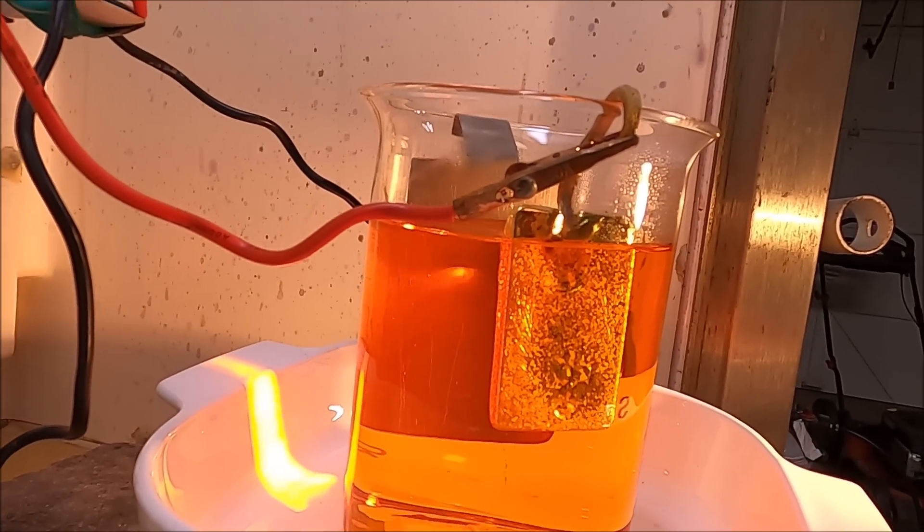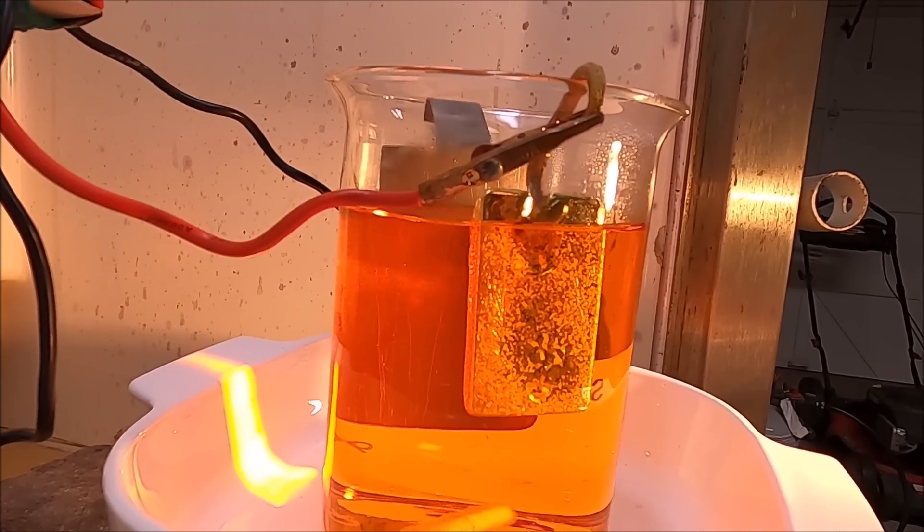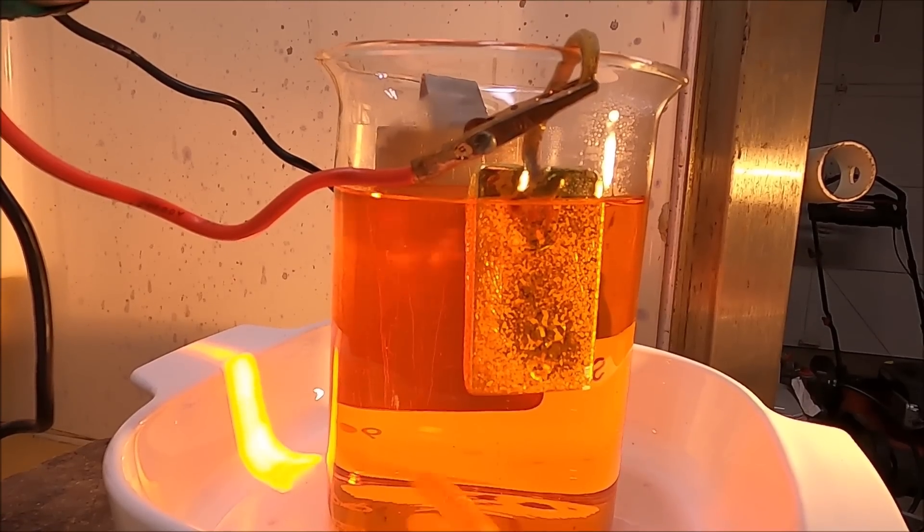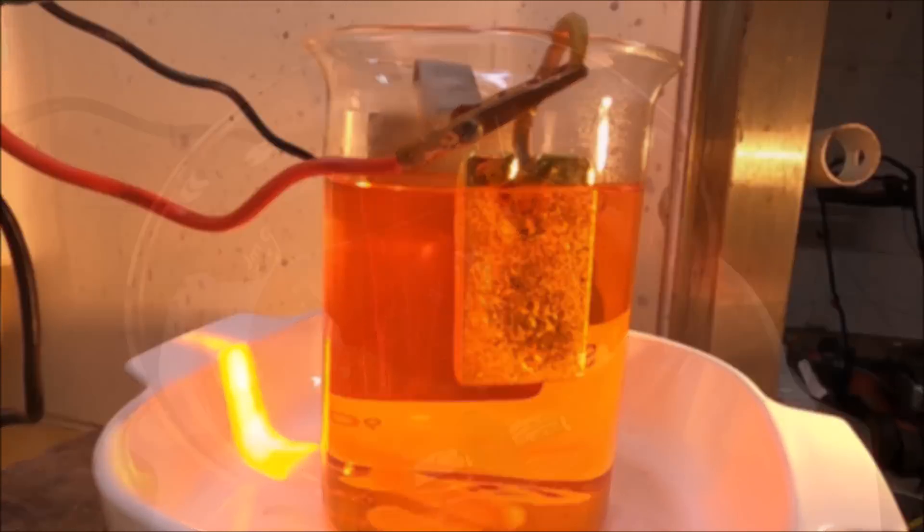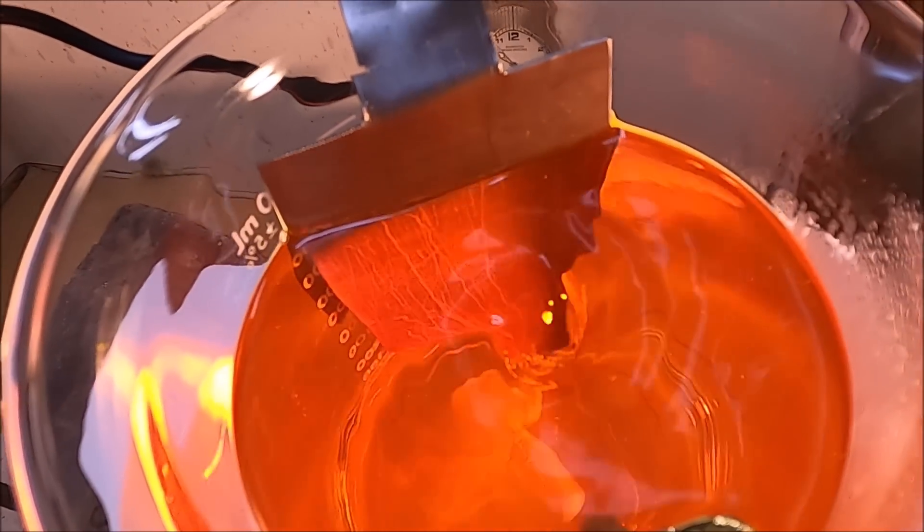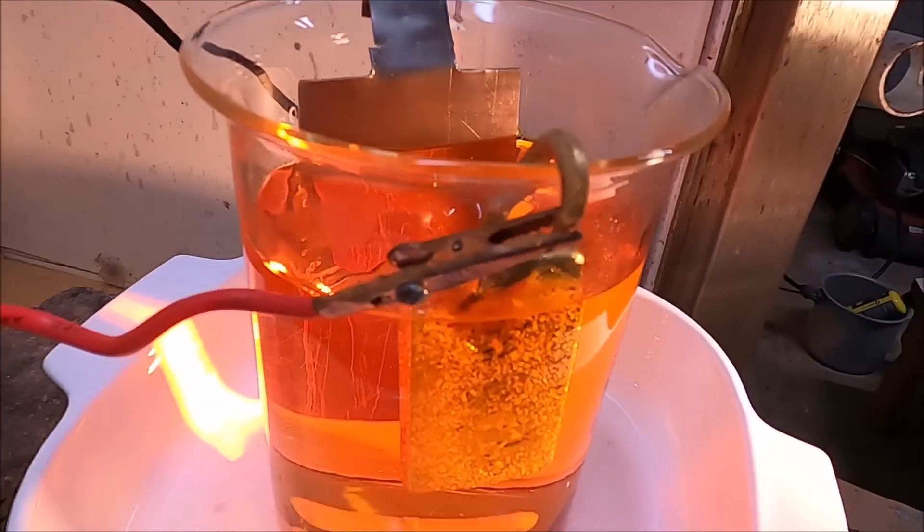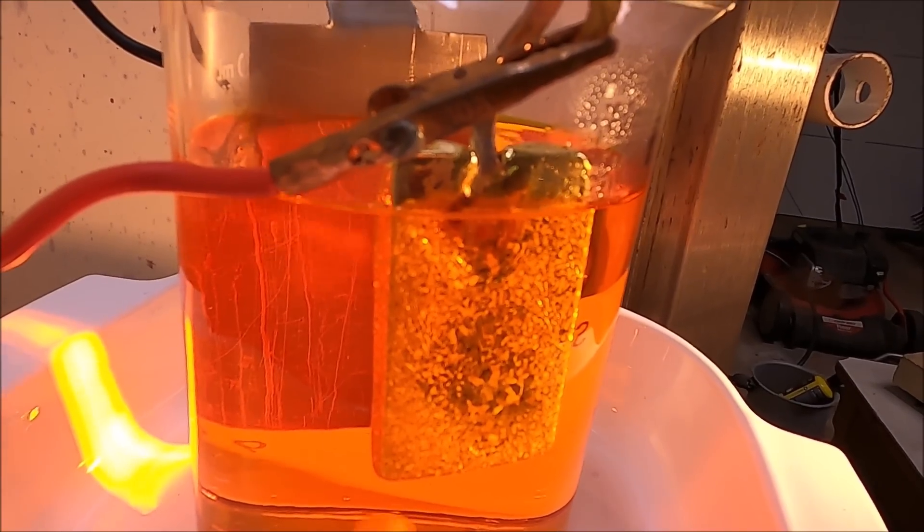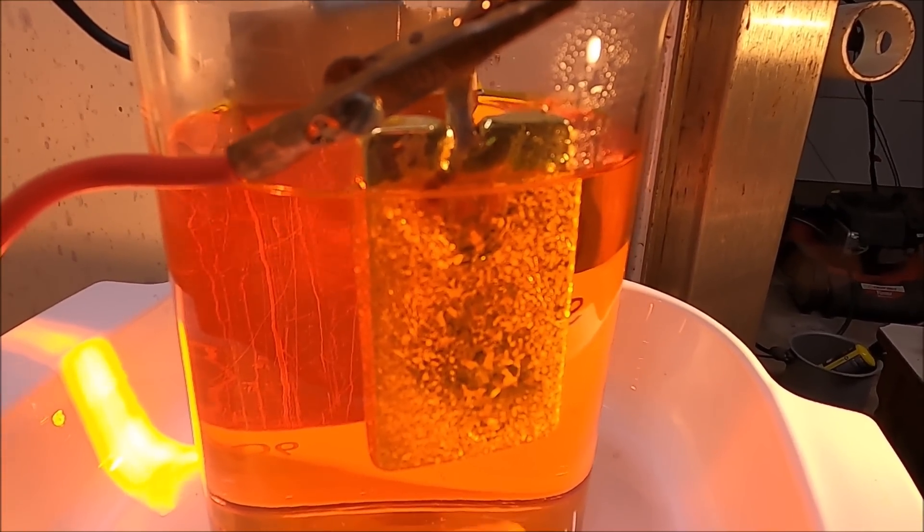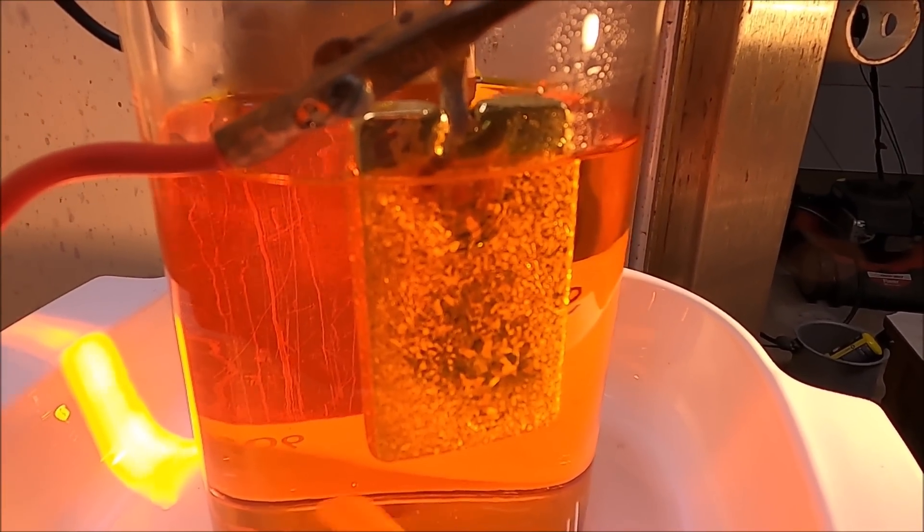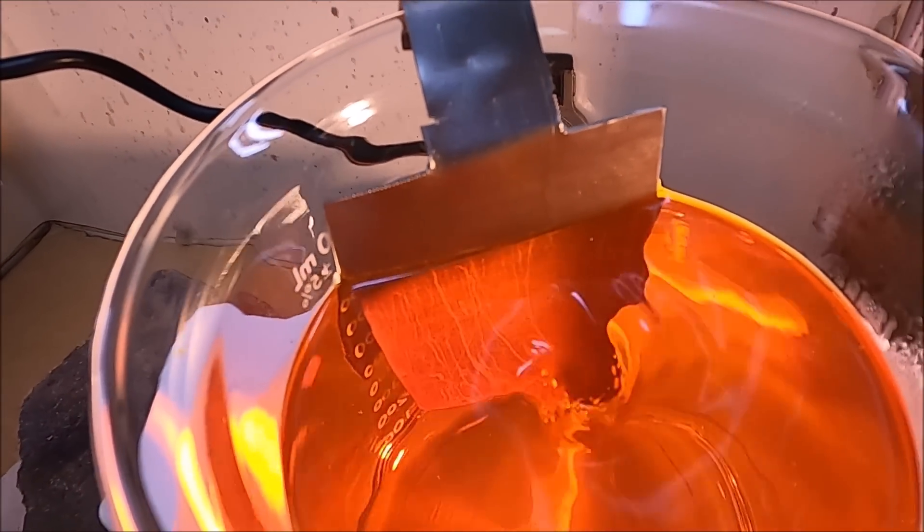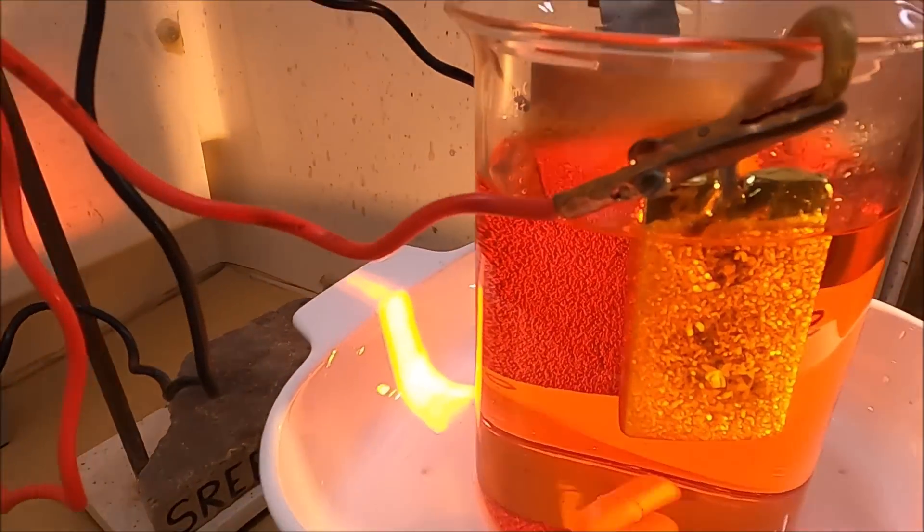We should get a noticeable change on that cathode as the gold dissolves off of the anode bar, travels through the electrolyte, and begins to deposit on the titanium cathode. I'm noticing a difference in the appearance of the cathode as the gold begins to deposit. Plus, the anode bar is starting to look like a crystalline structure as it dissolves from the electrolytic action.